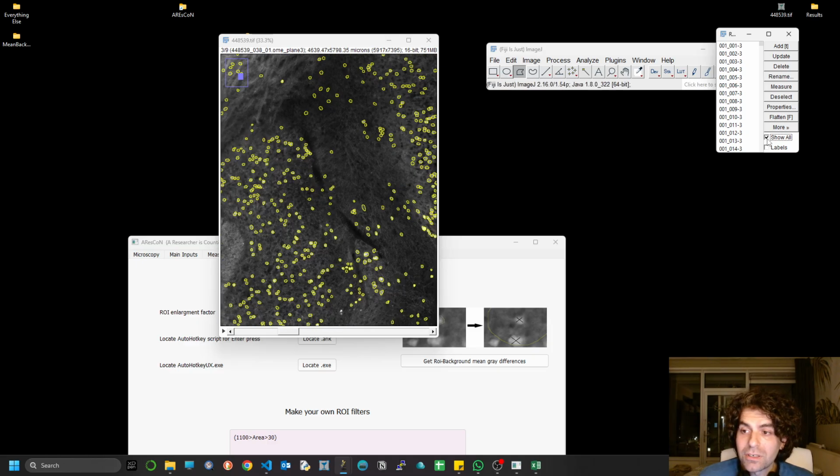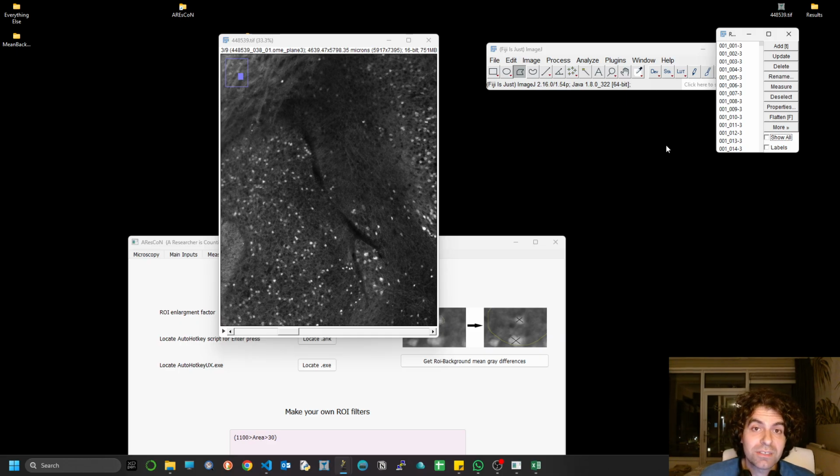So far so good, and this is pretty much the end for those of you who are interested in just XY filtering. Having said that though, I'm going to soon apply a complementary part that will utilize other pipelines for region detection, automated region detection. There are some pipelines that claim to do that completely automated after you train a network, and some pipelines that require you to send some landmarks. Not many, but still some landmarks to get predictions of the regions.